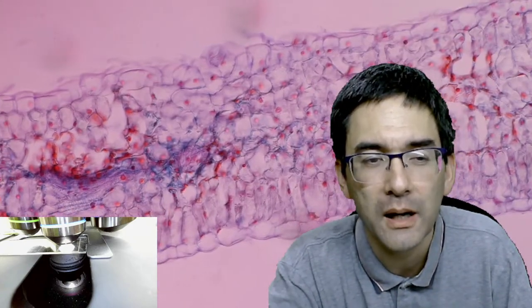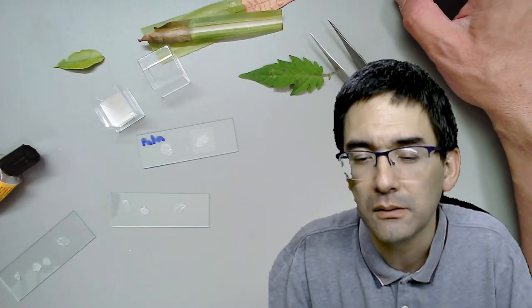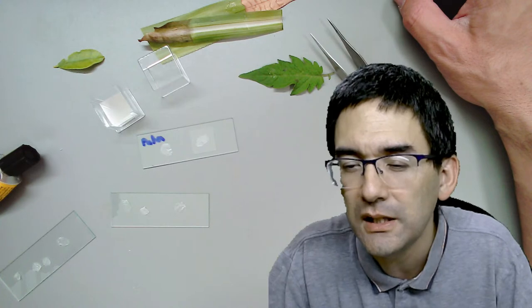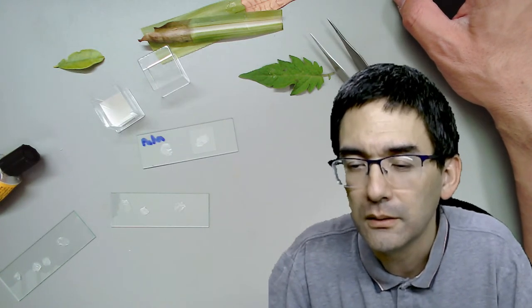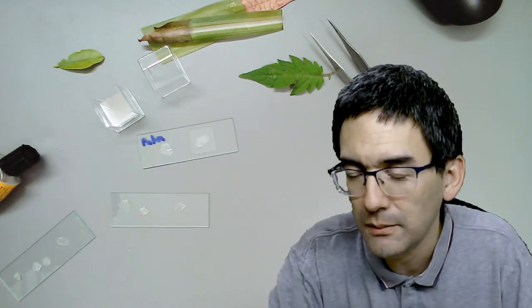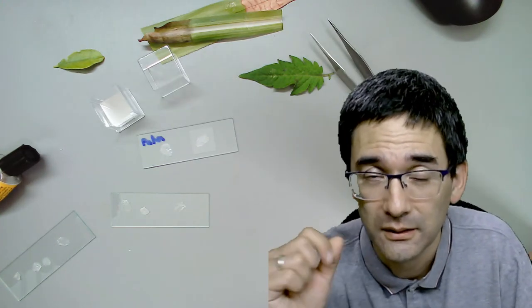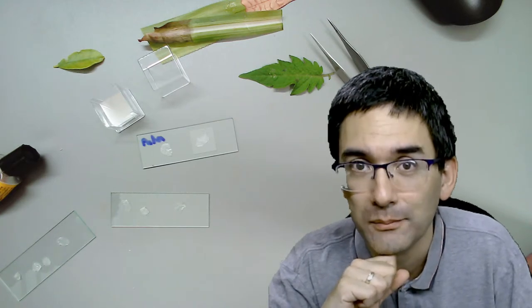In my slide box there are some parasites, but mostly animal parasites. When I find something in my garden I'll put it under the microscope. I'm getting carried away - I wanted to mostly talk about making leaf impressions. For today I'm going to leave it here - it's been almost 40 minutes. Powdery mildew is easy to see even if you're not very familiar with it. The plants in my garden had another problem - aphids, which really destroyed many of the leaves.